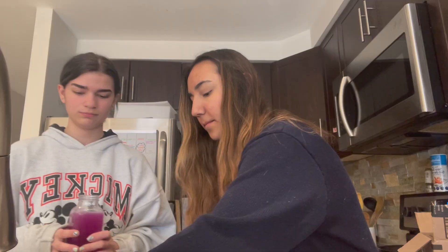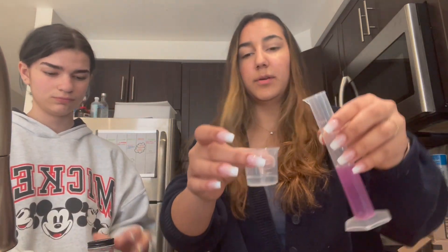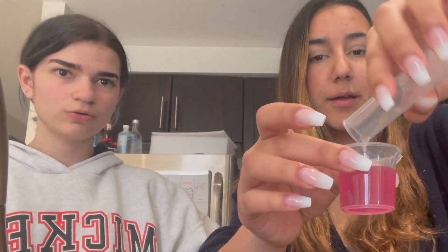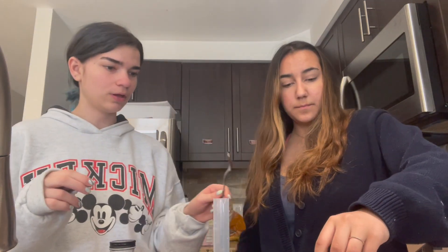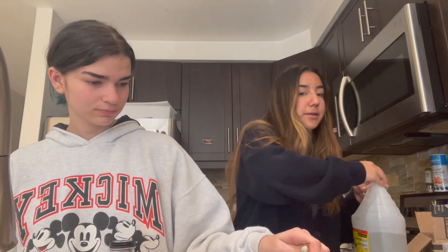I'm gonna pour it in here — we can do this three times, and if we mess up we have to do it more. We just made one of our prepared solutions and now we're going to make our dilution of baking soda — sodium bicarbonate. Here we're just preparing our vinegar sample and adding some pH indicator for the color change.